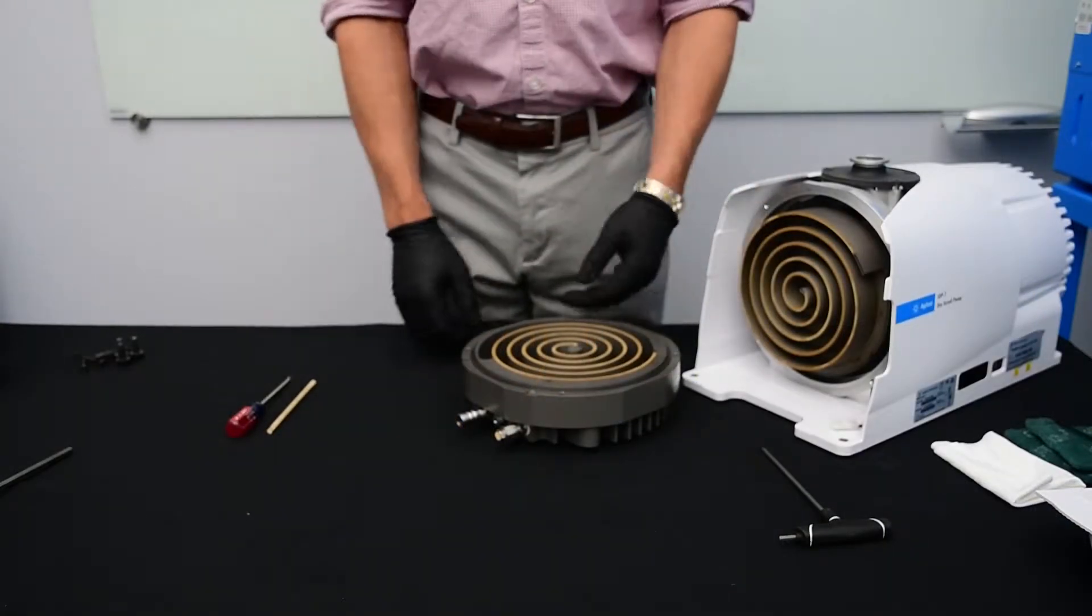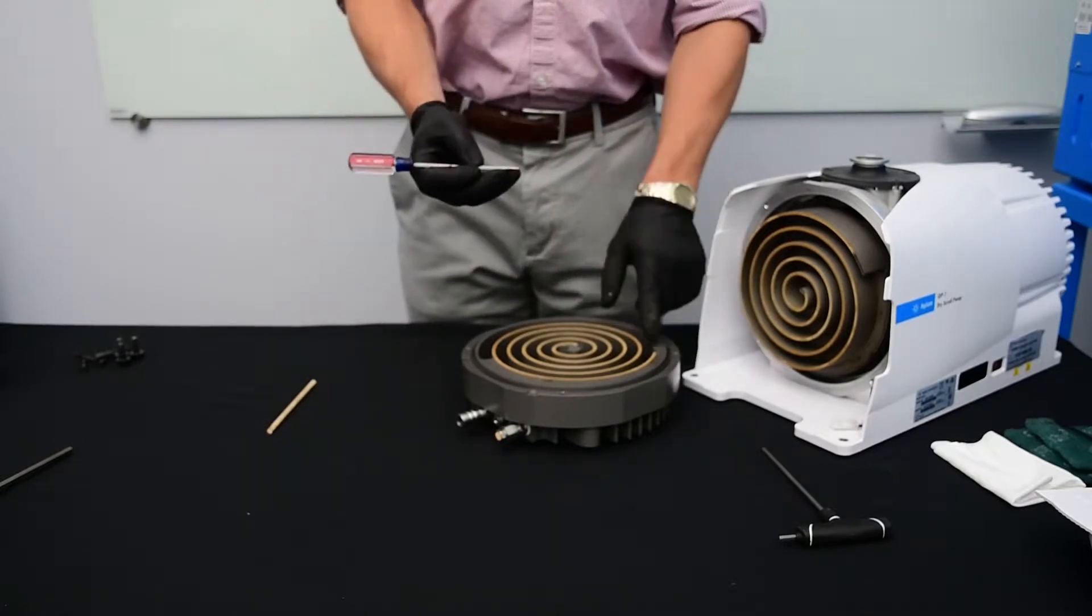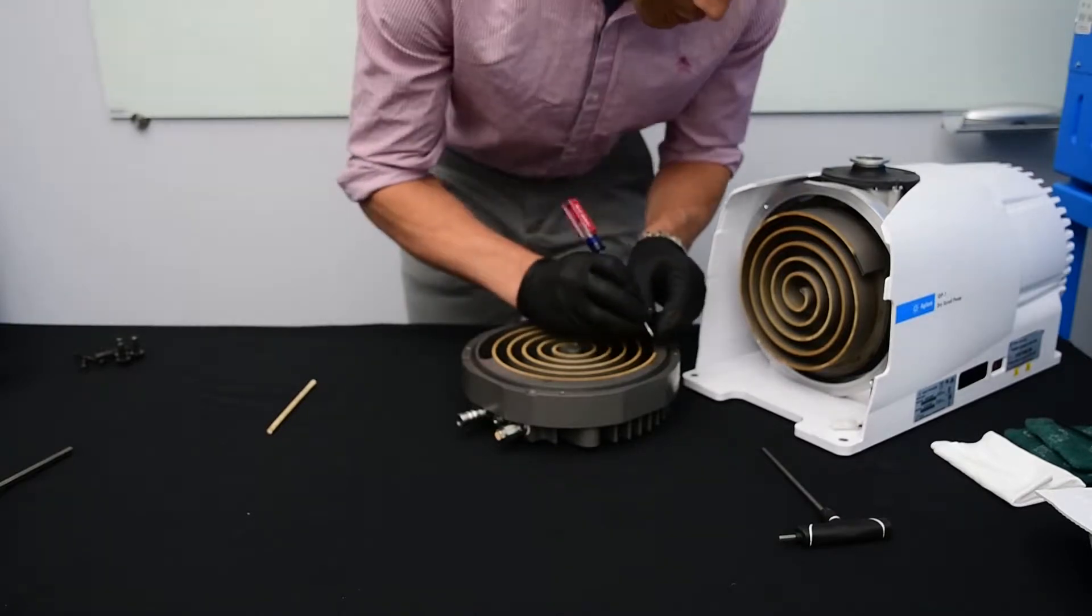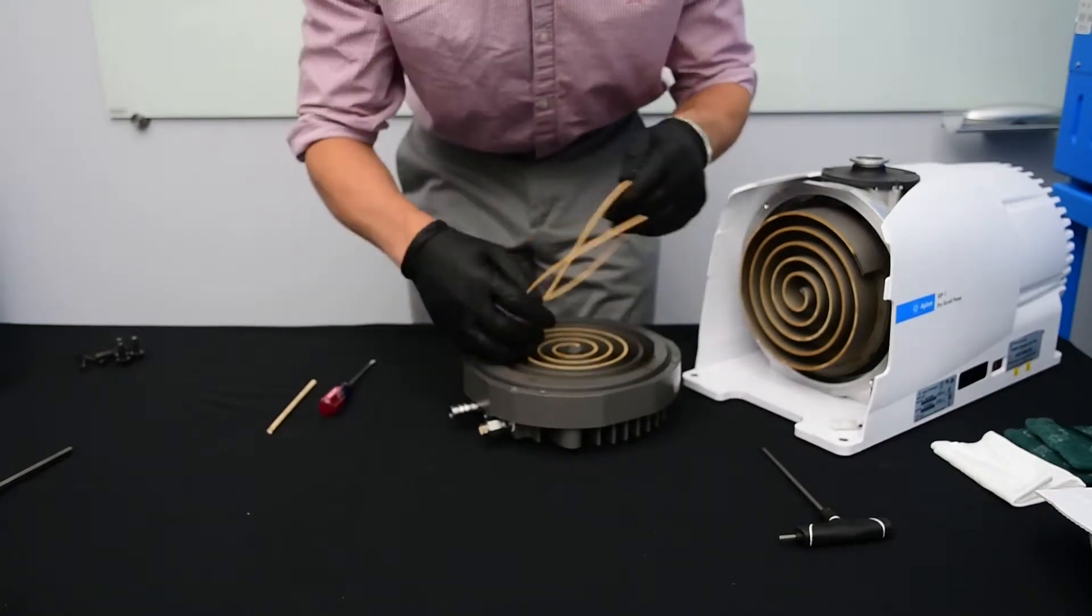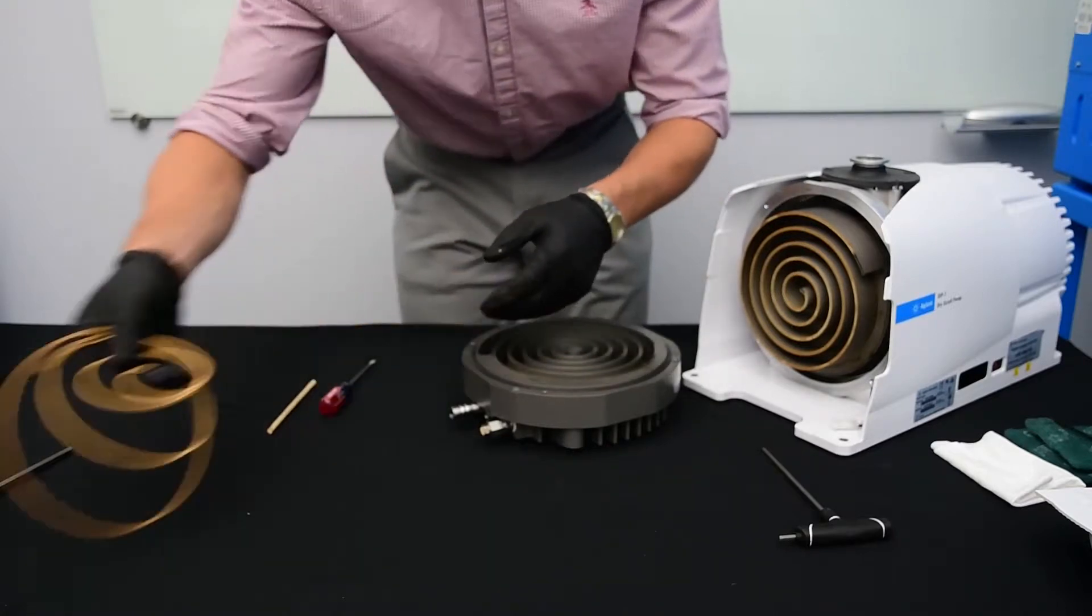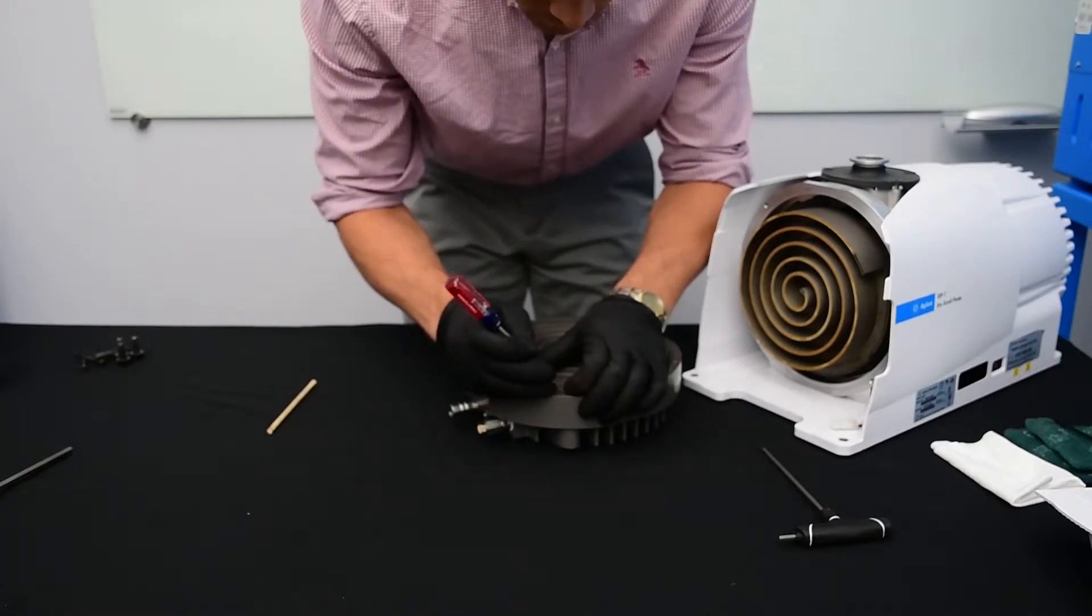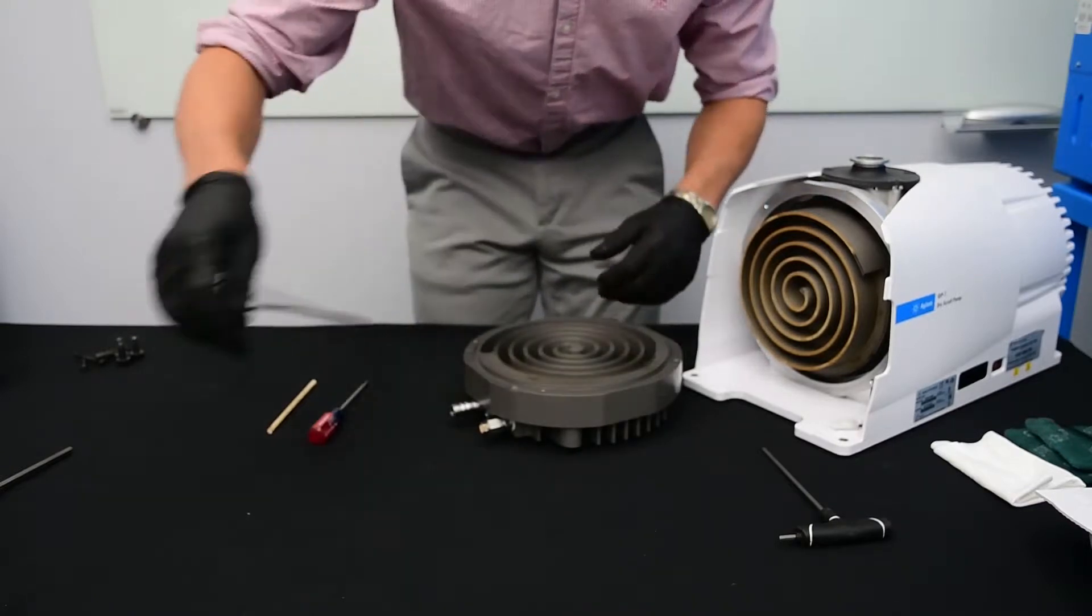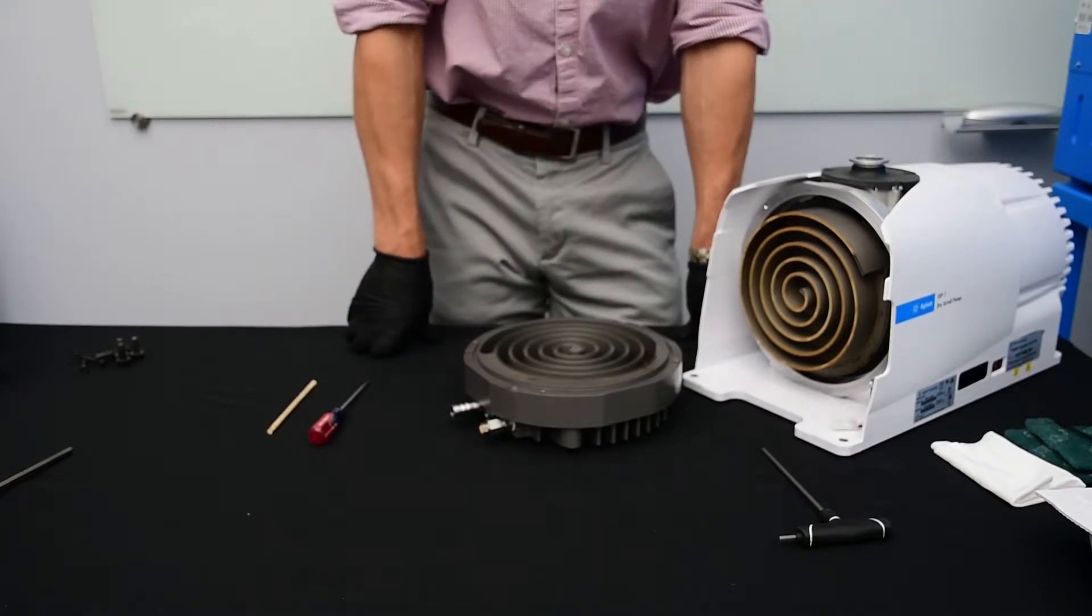Now we're going to go ahead and remove the tip seal and O-ring. I'm going to use a small screwdriver but being very careful not to scratch this anodized surface. Now discard both the tip seal and the O-ring as you'll replace both with the new tip seal kit.